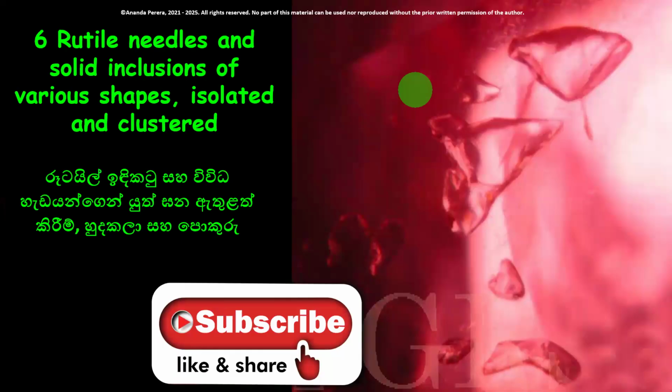What is this? See the inclusion here. Rutile needles also we can see, and solid inclusions here. Solid inclusions, rutile needles of various shapes and isolated and clustered together. See, it is natural ruby.